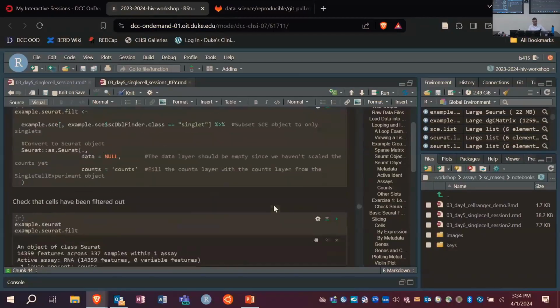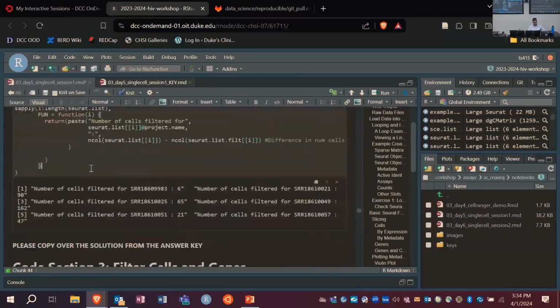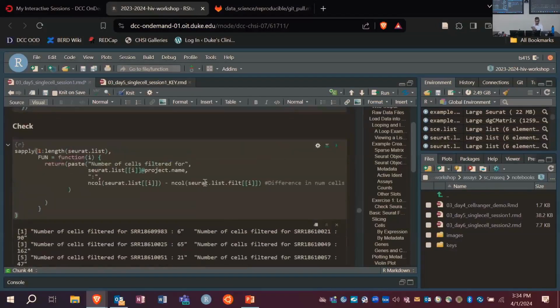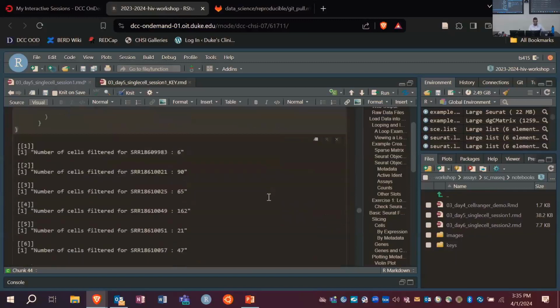So you have to use sapply here because you're comparing two list objects, right? So you need a third object that is a vector to compare them within, right? Or you could do it with lapply if you then created a list that encompassed both. You actually can do it with lapply either way. I think, I could be wrong, but if I just change this to lapply, I'm pretty sure it'll run just the same and it'll just return a list of those, right? They're both looping. It's just what it returns. So in this case, you get a list, and in sapply, you get that.